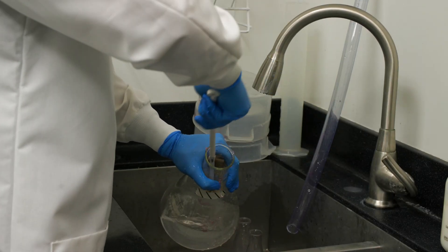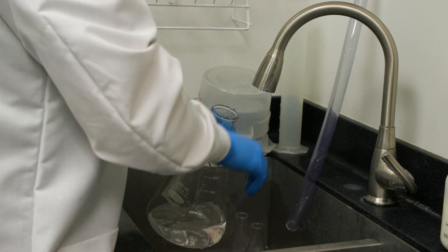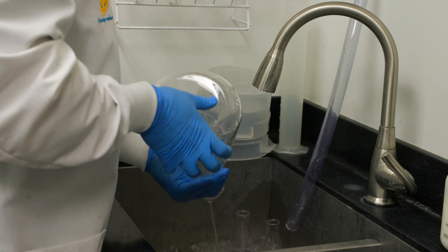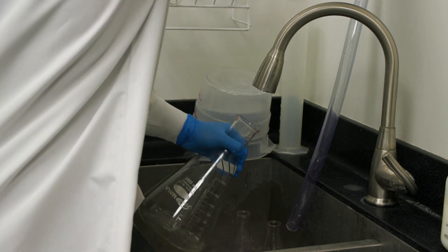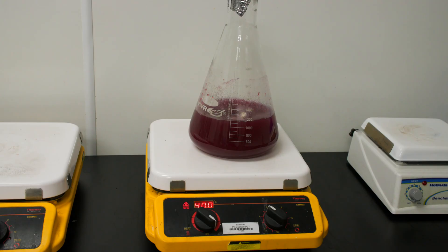When washing your glassware, be sure that all detergent and soap residues have been thoroughly rinsed off. Rinse with deionized water, since any detergent residue could inhibit the growth of bacteria in future batches.